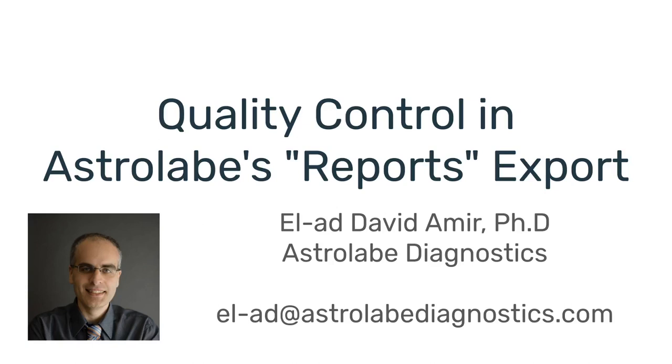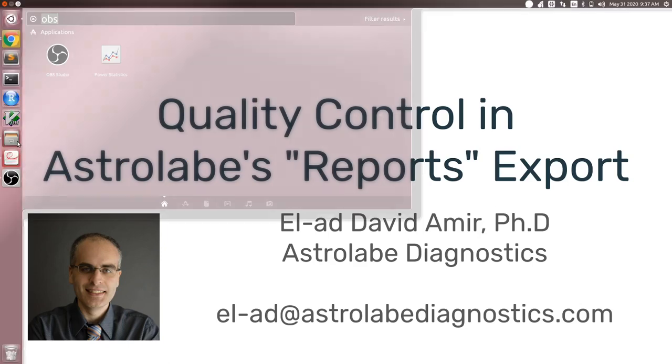Today I would like to discuss the quality control aspects of Astrolabe's report export. Part of the Astrolabe platform is that you can download all of the analysis that Astrolabe has done in various formats. For example, you can download FCS files, you can download R files with single cell data, and finally you can download one big export called reports, and that includes spreadsheets, PDFs, and figures that cover every part of the analysis. One of these is different quality control measures, and I'm going to demonstrate them now.